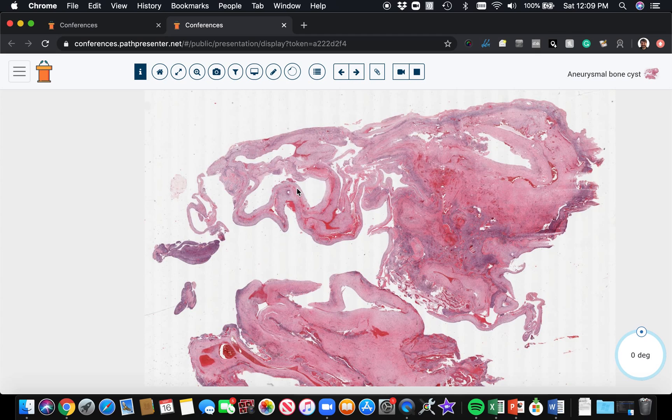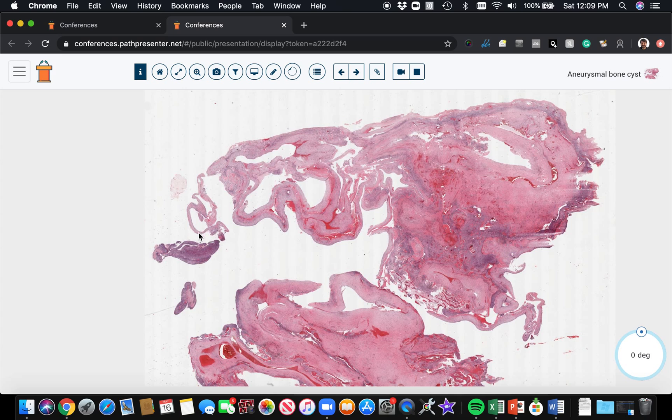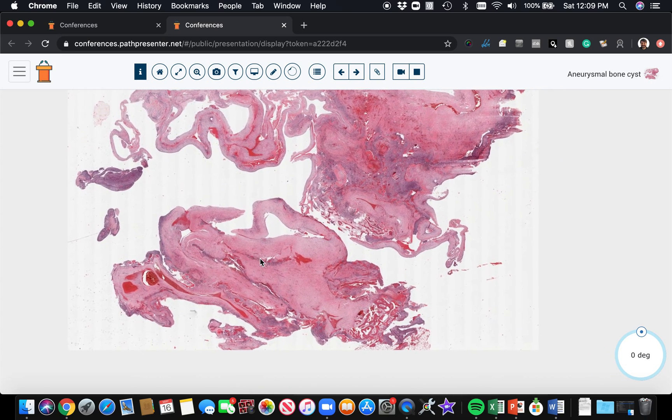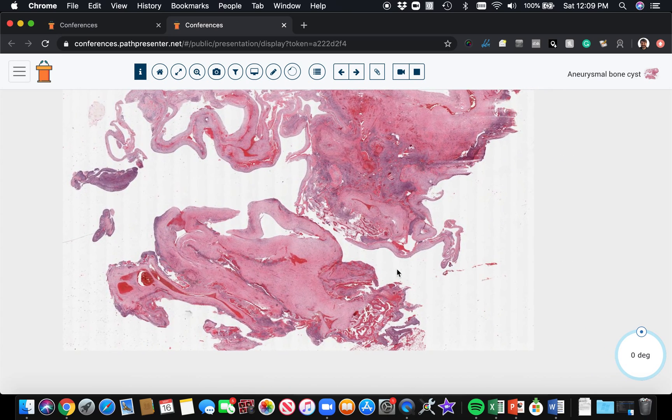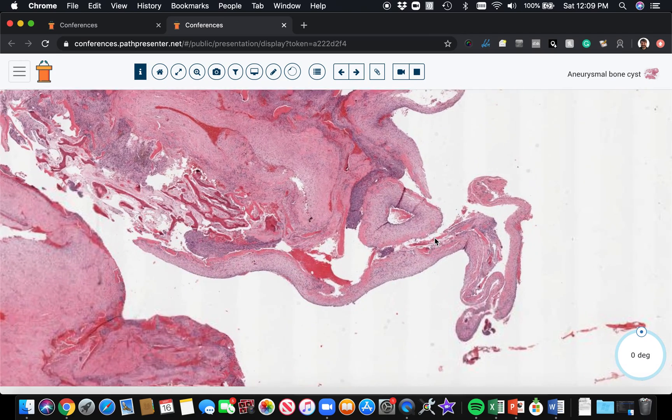When we get it and process it, a lot of the blood will wash out and leave these open empty cystic spaces. Sometimes, depending on how fragmented the specimen is, you may see just these little cyst walls here but not see actual intact cysts.